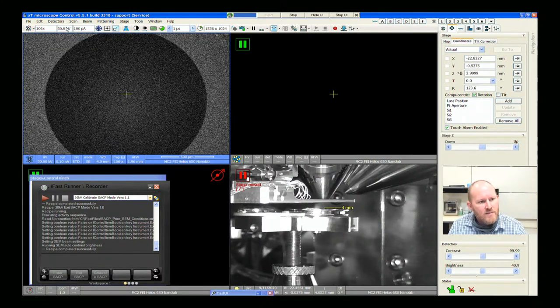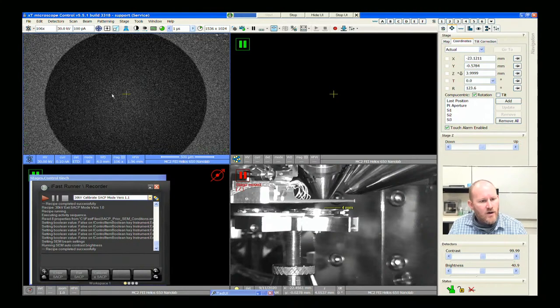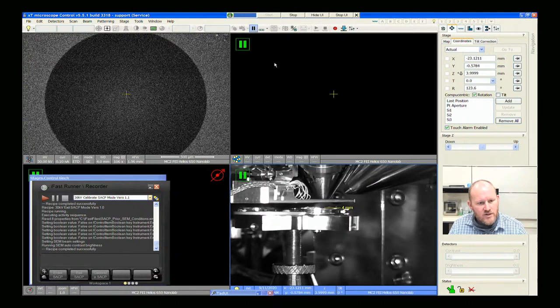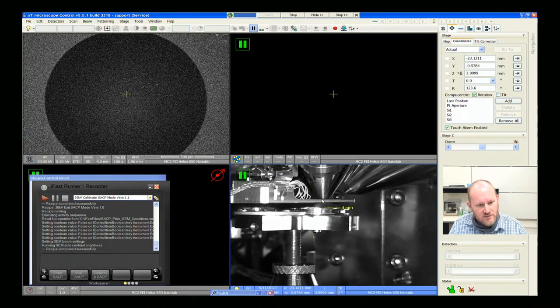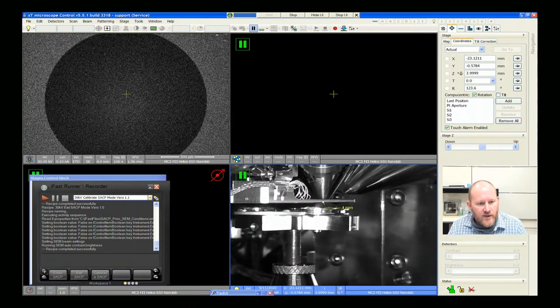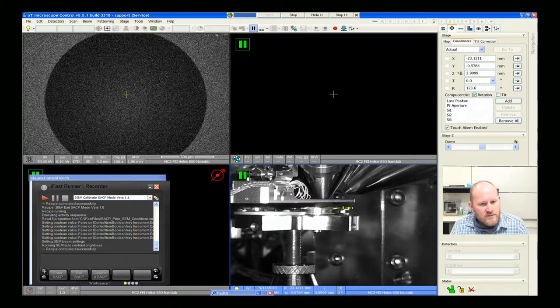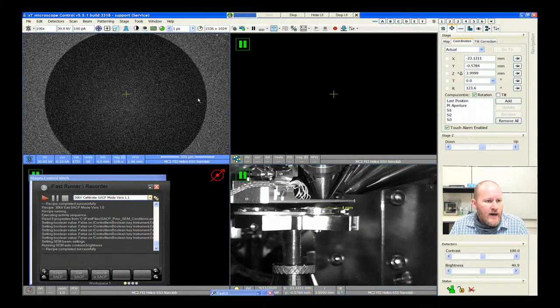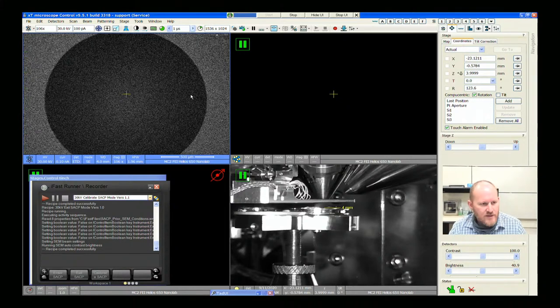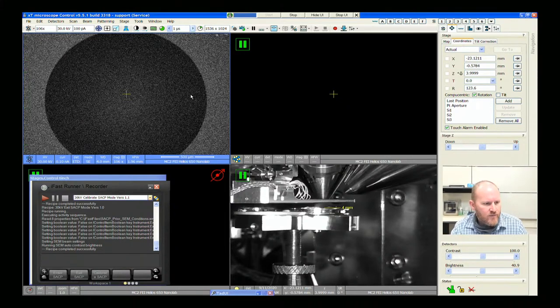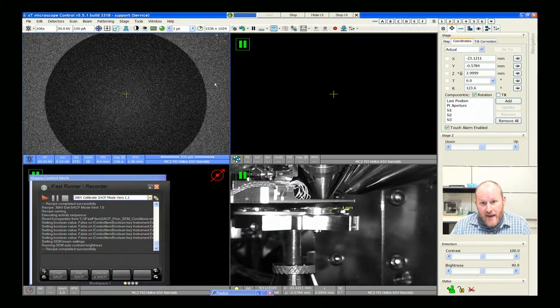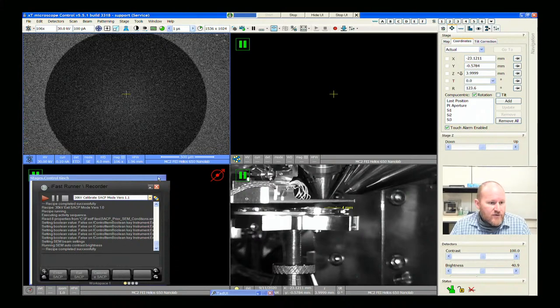So now we have a 30 kV beam and we are at four millimeter working distance. We're at a four millimeter working distance — distance between the focusing lens, which in this case we're in mode one, so that's the HR lens, not the UHR lens. At this point, this is where we really started with SACP — before we had the iFast script, before we figured out how to pop in and out of the object model, we built these manually. So I'm going to do that.